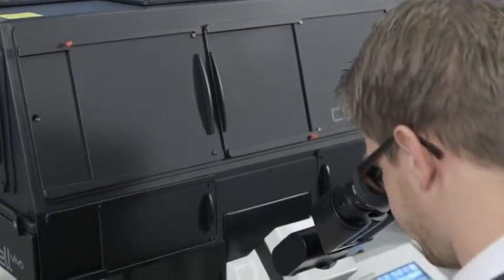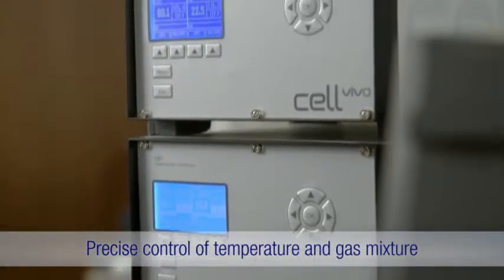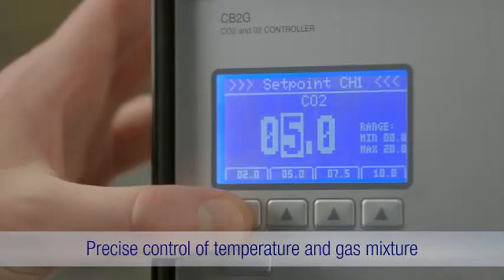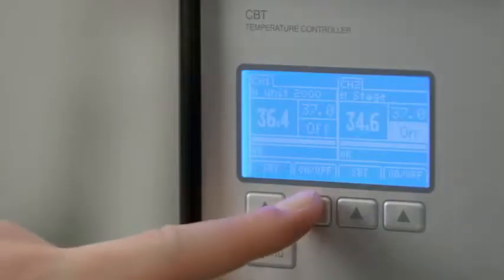With stable temperature control up to 25 degrees centigrade above ambient temperature, and gas mixture control of CO2 and O2, Cell Vivo ensures maximum sample integrity.